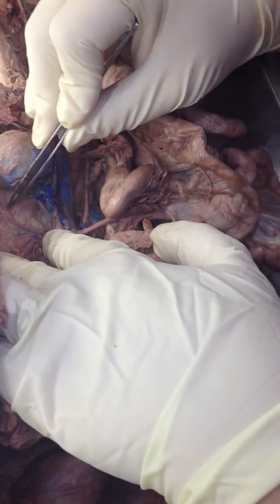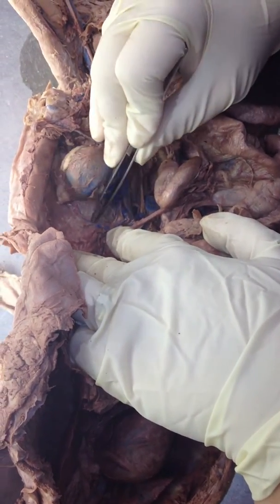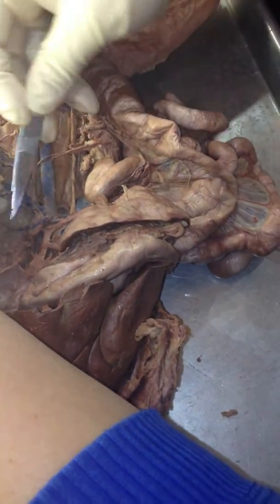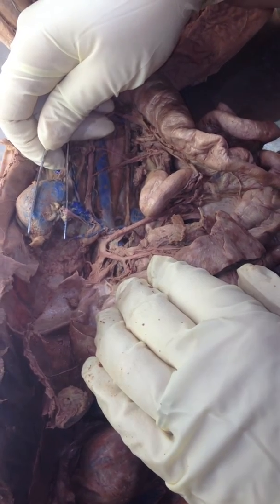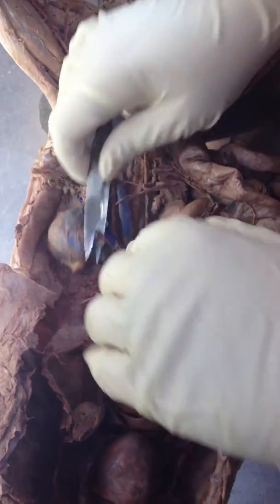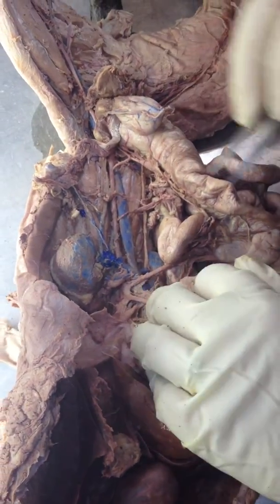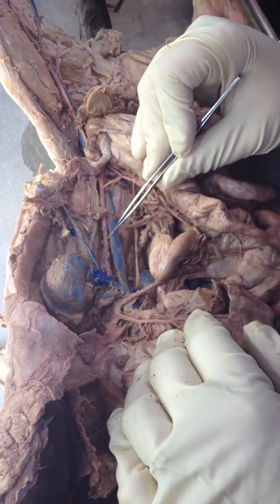Coming off of the dorsal aorta, comes over here and comes down on here. Adrenolumbar. You might have to do the other side on that. It's right there. That's the rectal aorta. Not rectal. Oh, but adrenolumbar. No. Nope. Renal. On the right, renal. Good. Renal? I was close. Okay, close in my mind. I need to get my spelling right.